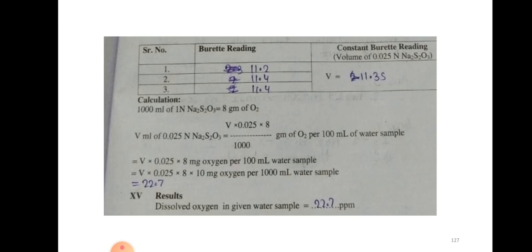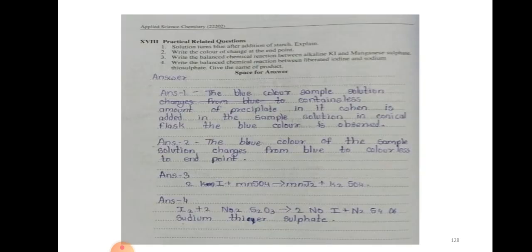Correspondingly we are going to determine how much ppm of oxygen is present by using this formula. The question answers related to this are already explained during the theory part.